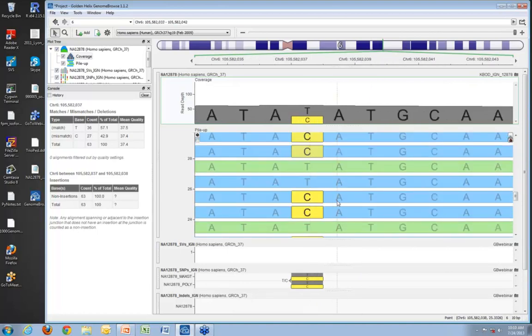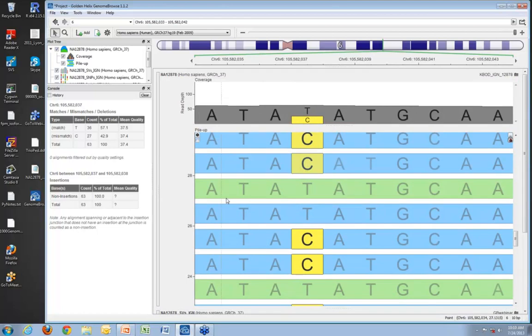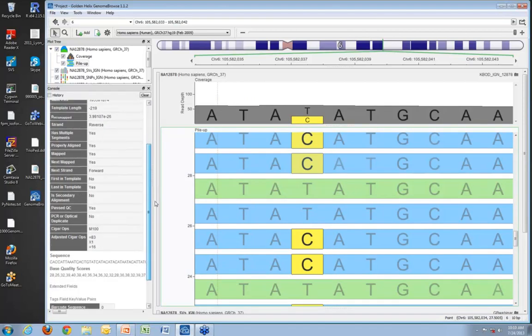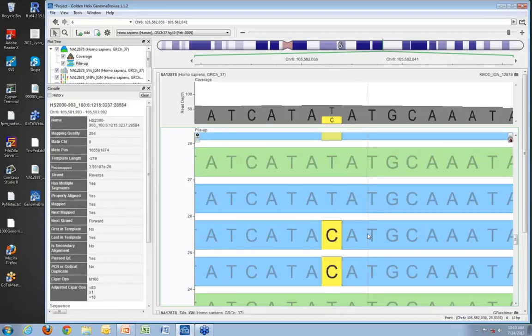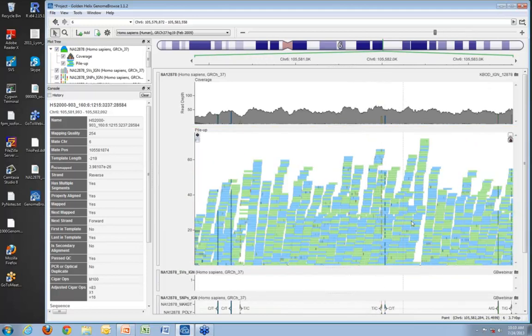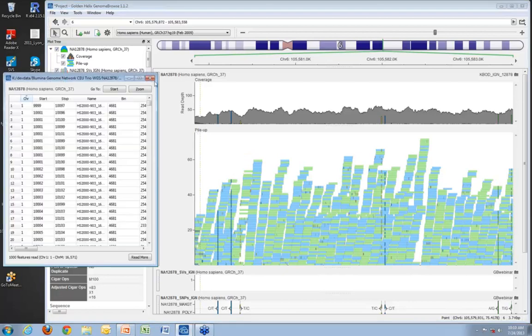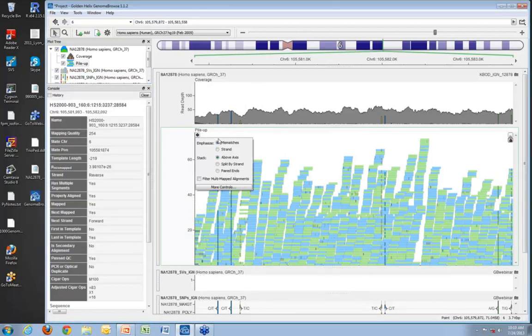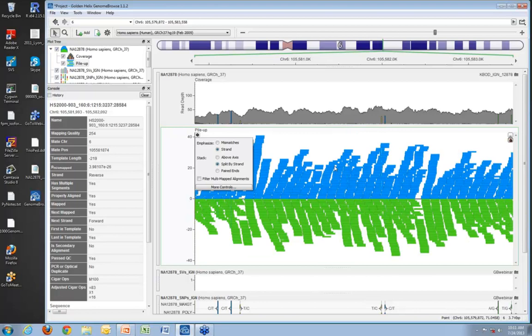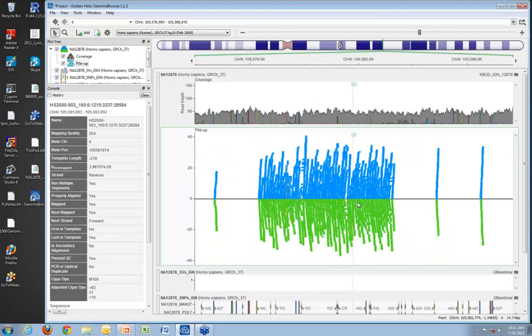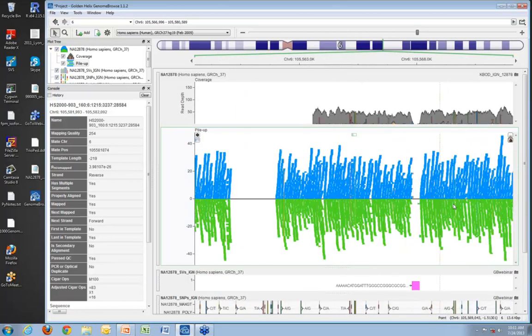Zooming in further, I can see individual bases within each read and click on reads to get all detailed data from the BAM file, including individual base quality scores. Zooming back out, I have the ability to change the view — instead of emphasizing mismatches with colored blocks representing non-reference alleles, I can highlight strandedness, split data by strand showing forward strand reads above the axis and reverse strand below, which helps recognize strand bias and coverage issues.